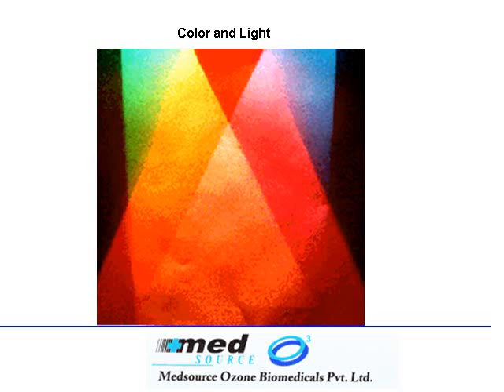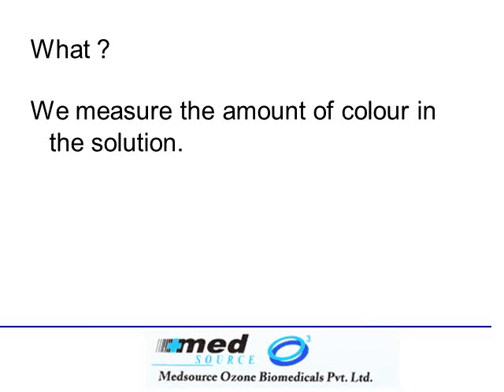Spectrophotometry deals with color and light. First, let's understand what is spectrophotometry. Very simply said, we try to measure the amount of color in a solution. This is what is spectrophotometry. The more important question, however, is why do we try to do this?